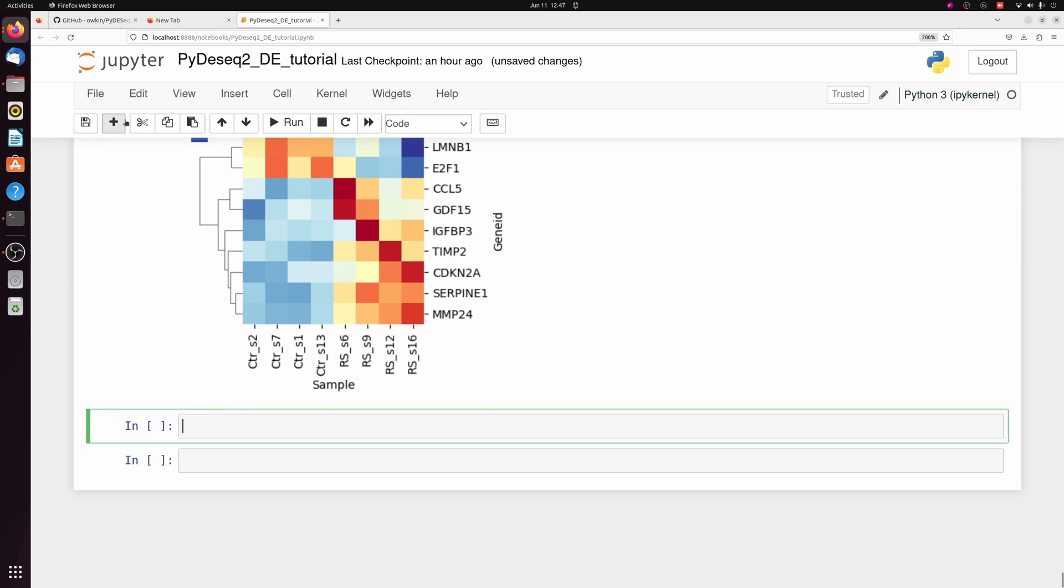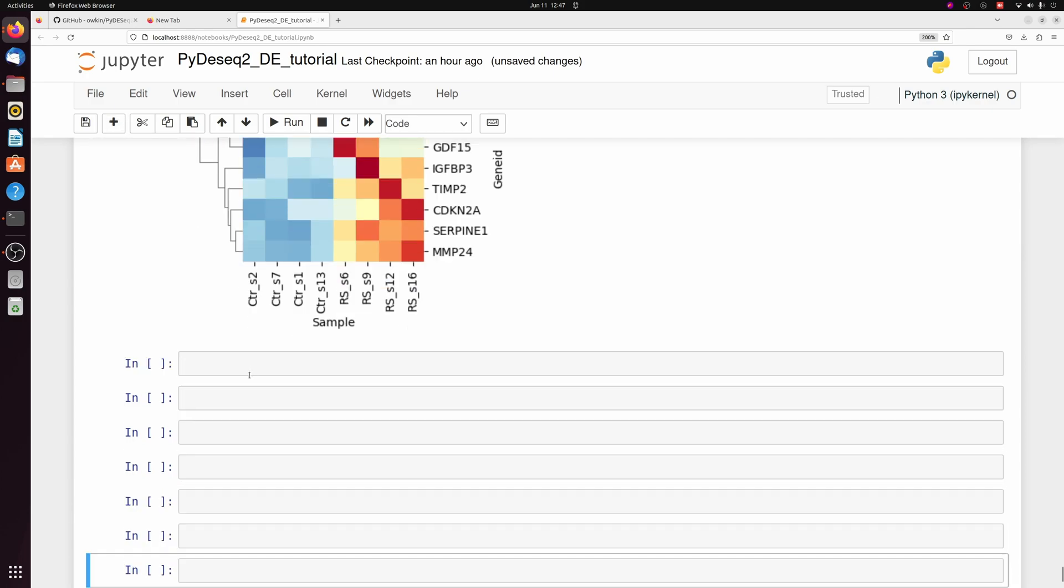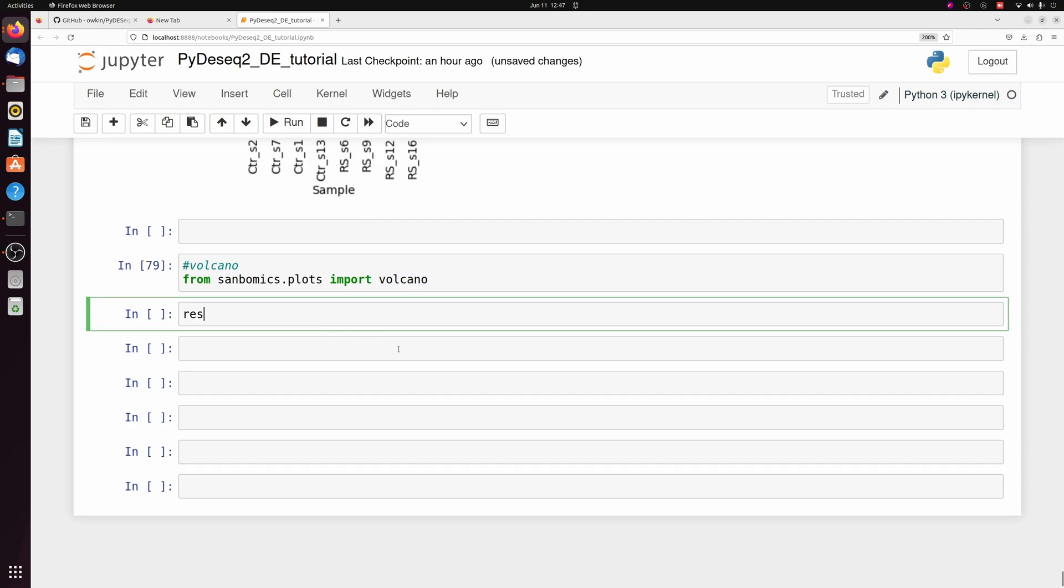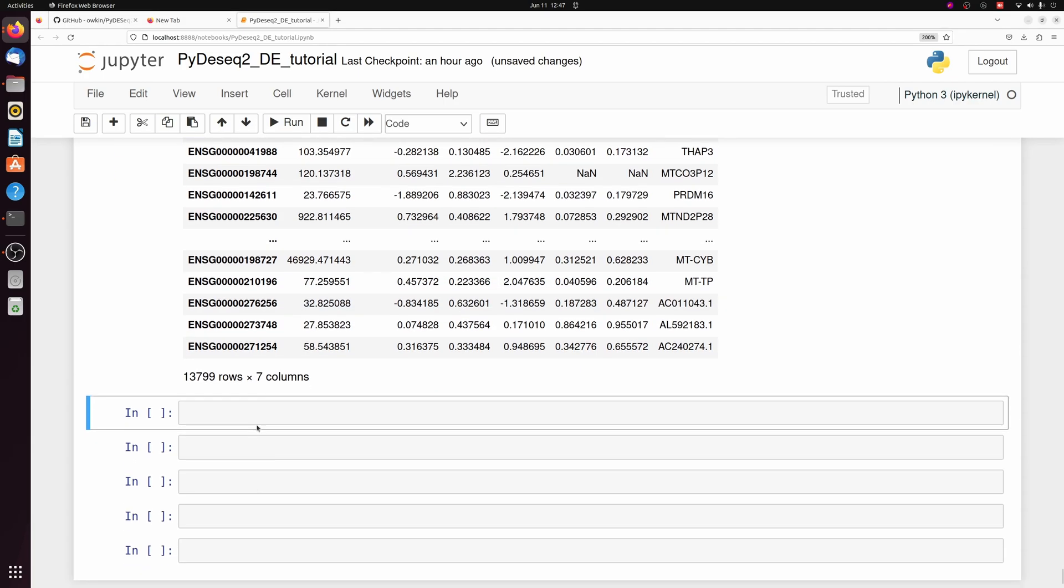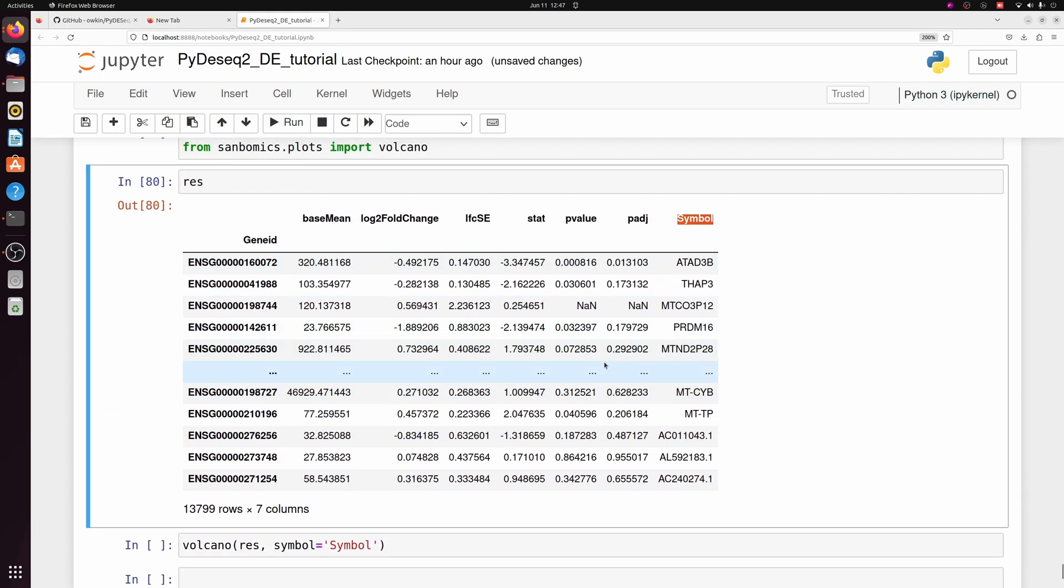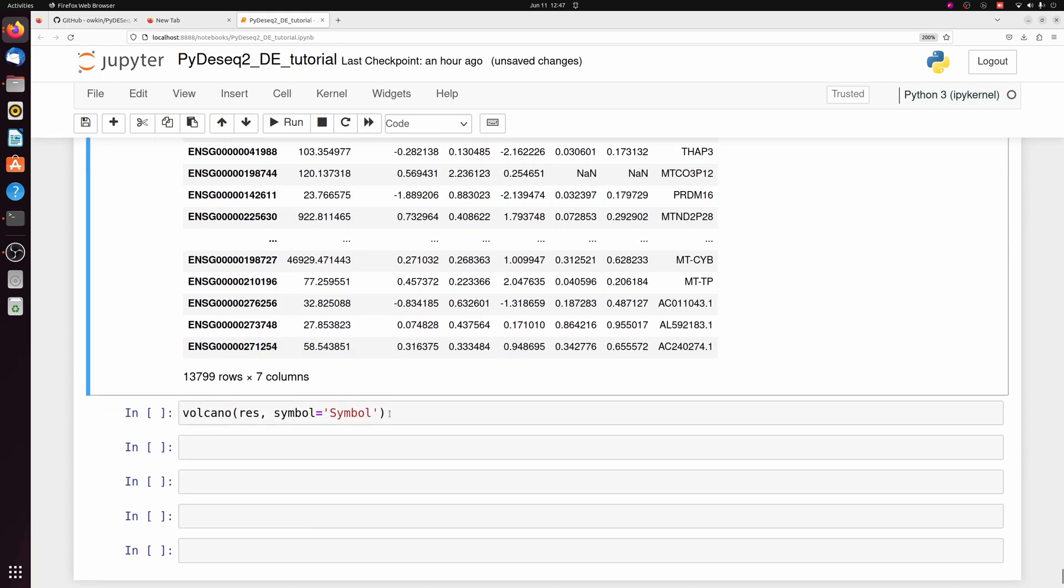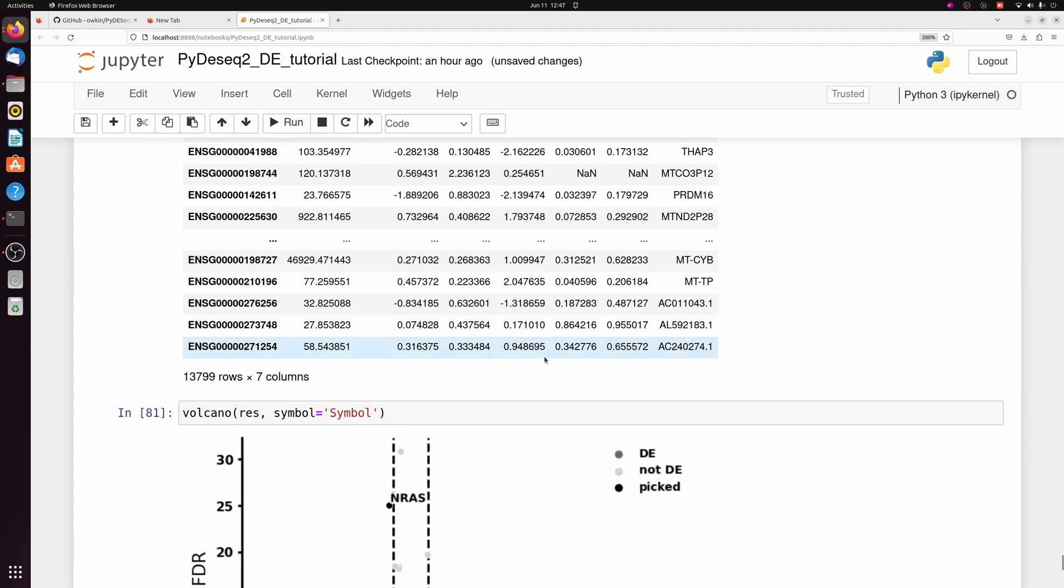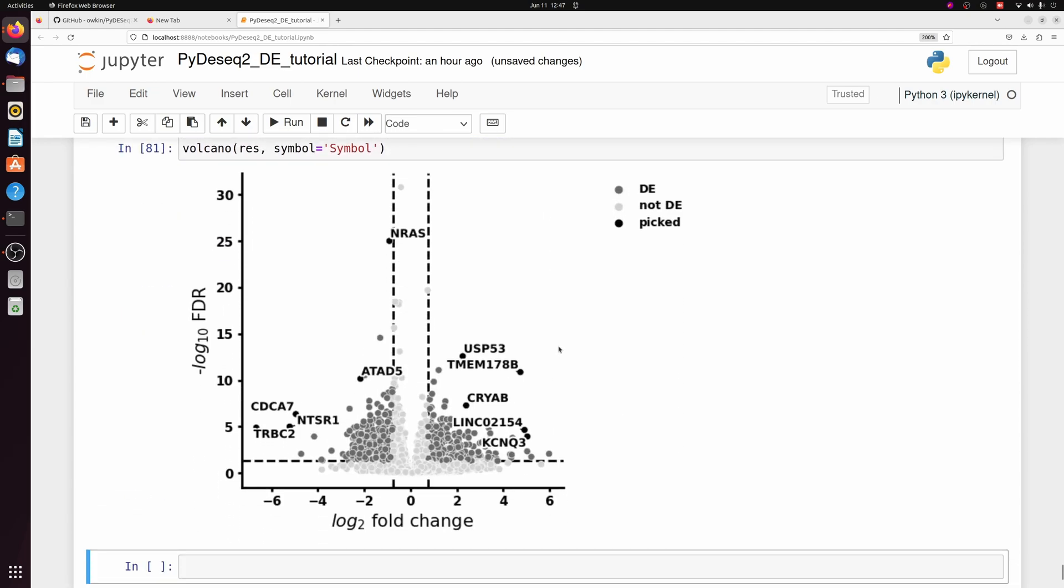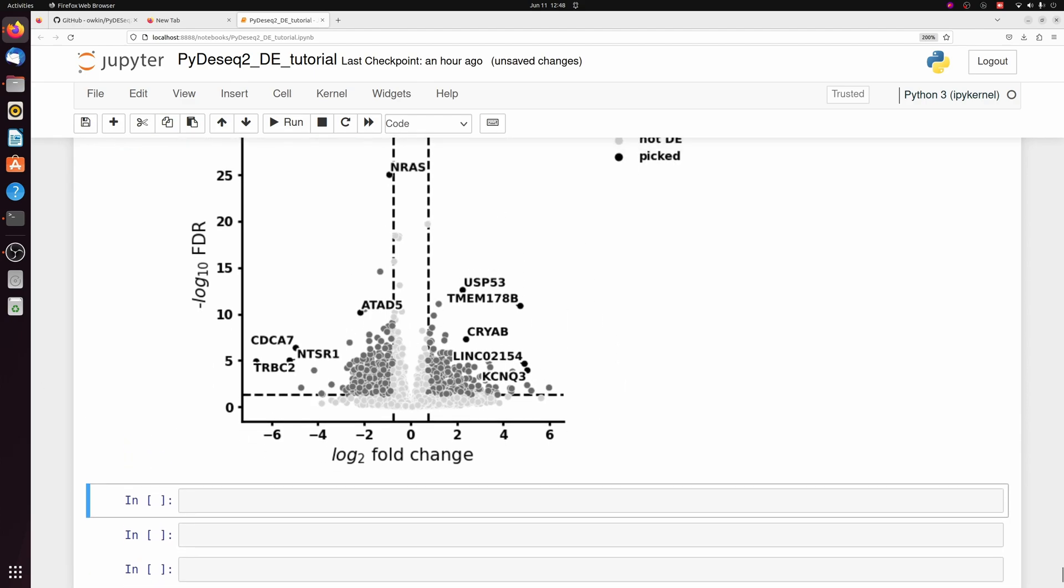And then finally, I'll just show how to make a quick volcano plot. Within my Sambomix package, I have a volcano function. So again, we have the res data frame. We're just going to pass this directly to our volcano function. And we have to specify we want to label the symbol column here. And there we go. We got a one-line volcano plot. You can change some of the thresholds here and what you want to label.